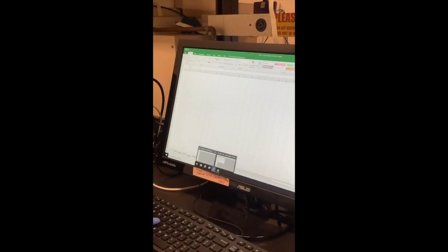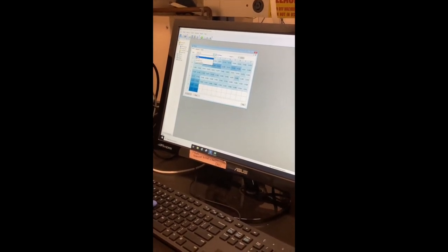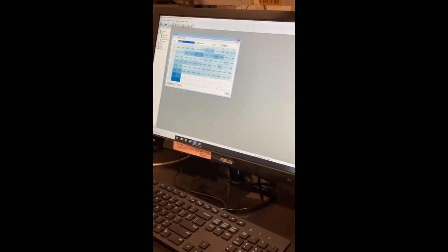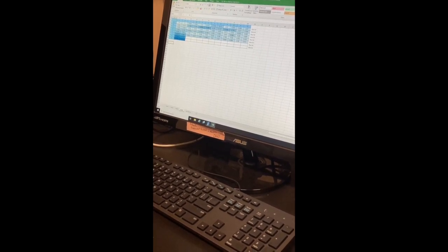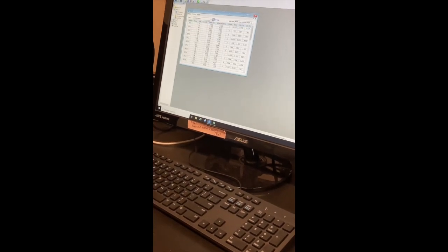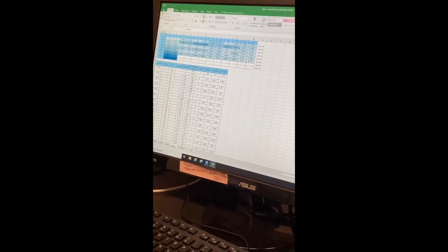So when you have your data and you're ready to export it, you want to click blank 562, because that normalizes your absorbance values to a blank of 0. And you want to click this little button, and that will export it to an Excel sheet. And if I click down here and I go back, I click statistics, and I make sure I have it on concentration, because that's the important value you really want from this. You click the button again, and that will be exported.